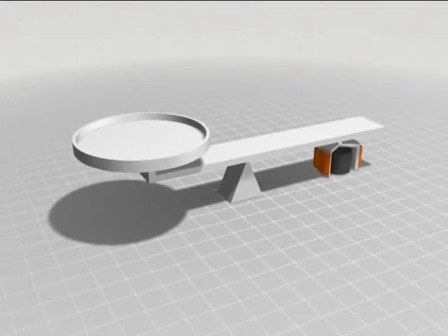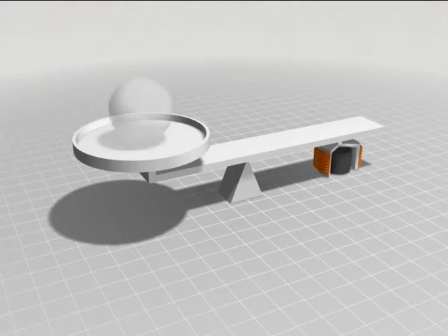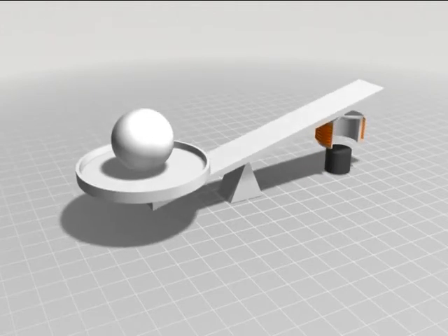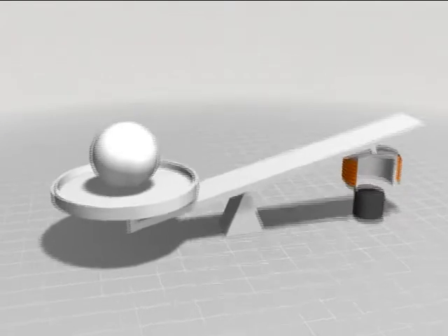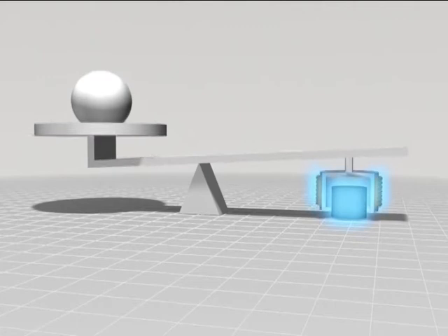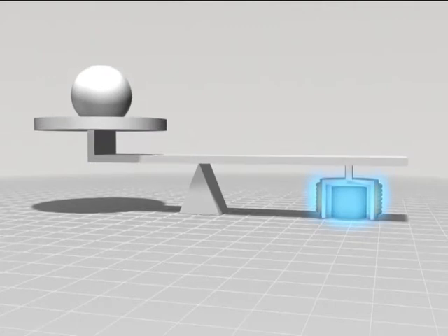The basic principle of electromagnetic balance is like the lever and fulcrum structure shown here. When the item to be weighed is placed at the force point, the action point moves as shown. This movement is detected by the position sensor. An electromagnetic force is used to balance the force point and the action point. The weight value is then determined based on the amount of current required.